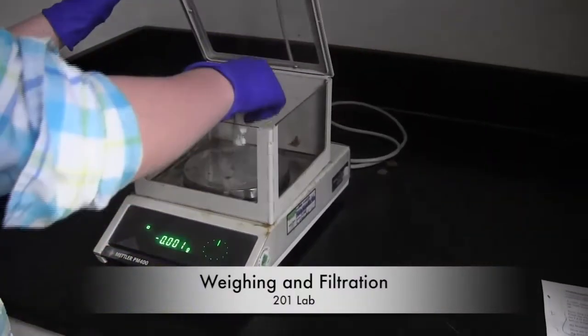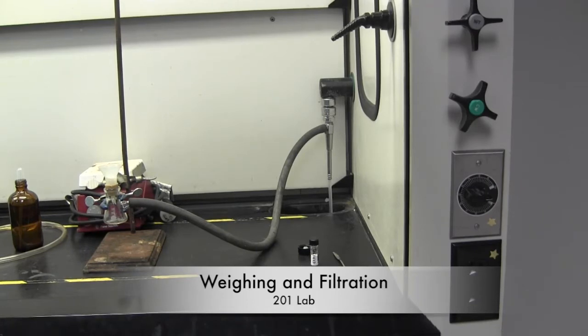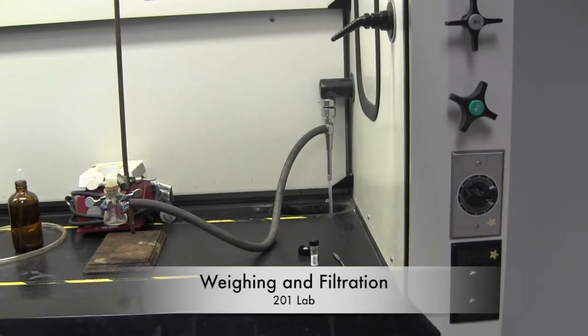In this lab, you will learn how to use the electronic scale and how to set up a Hirsch filtration apparatus. These are two scales you will use in most labs.